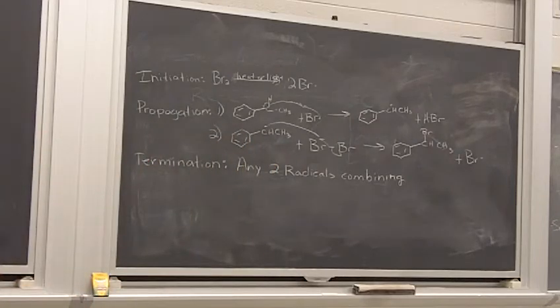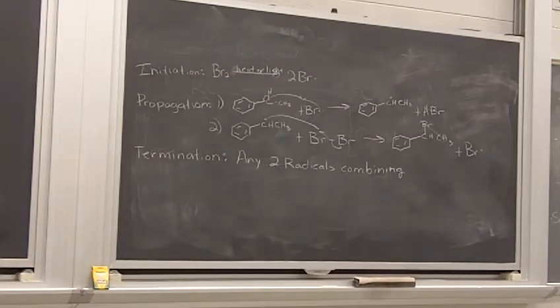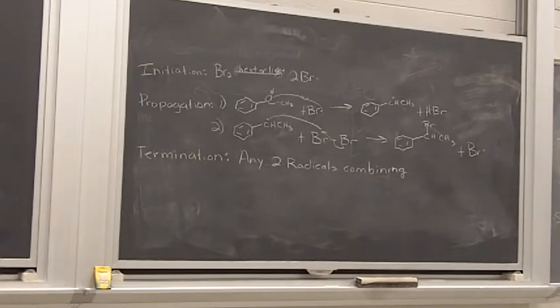And so during this, you will also potentially see different color changes in your reaction. So the bromine is like, if you remember experiment 6, the bromine solution was kind of orangish reddish color. You might start seeing kind of orange colors forming in your reaction as that bromine's being generated and then being consumed, okay?